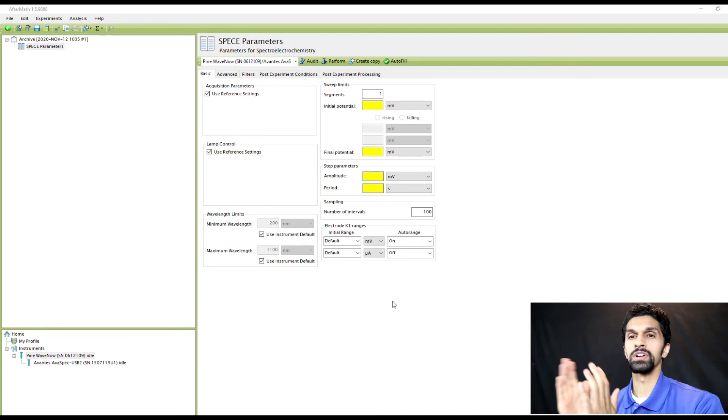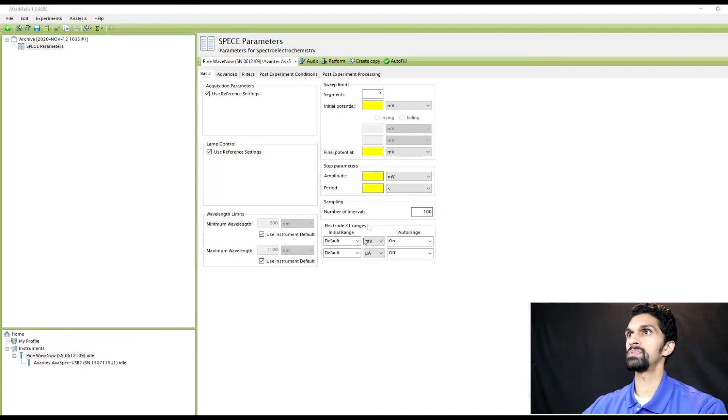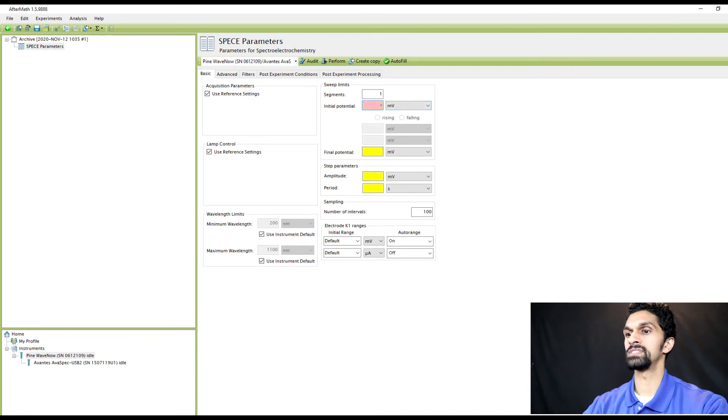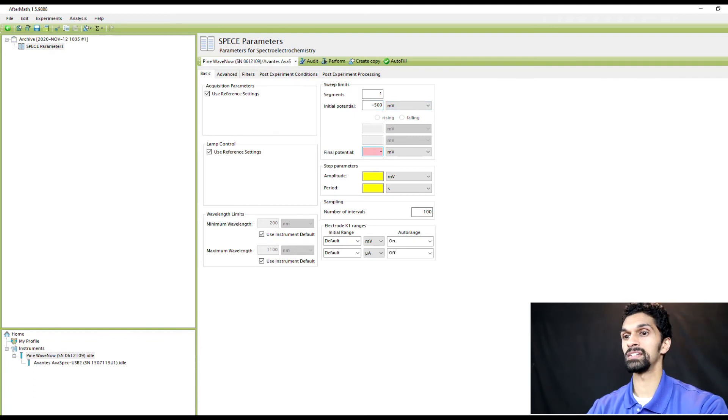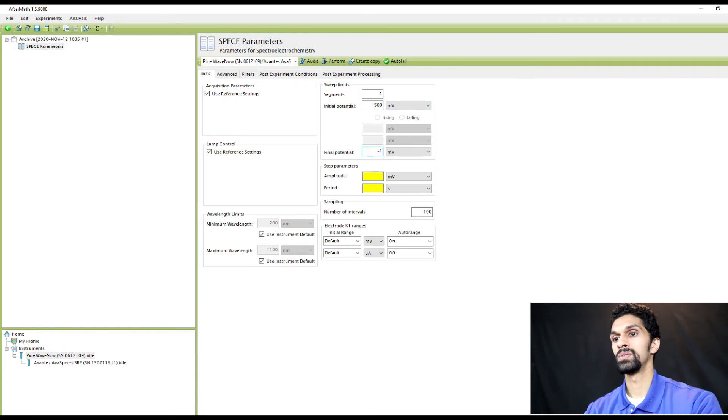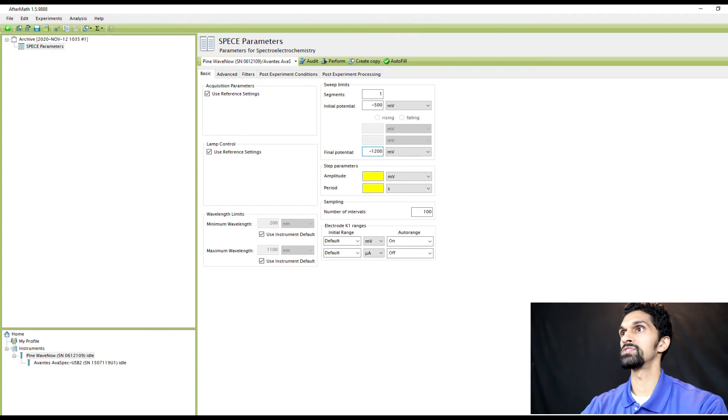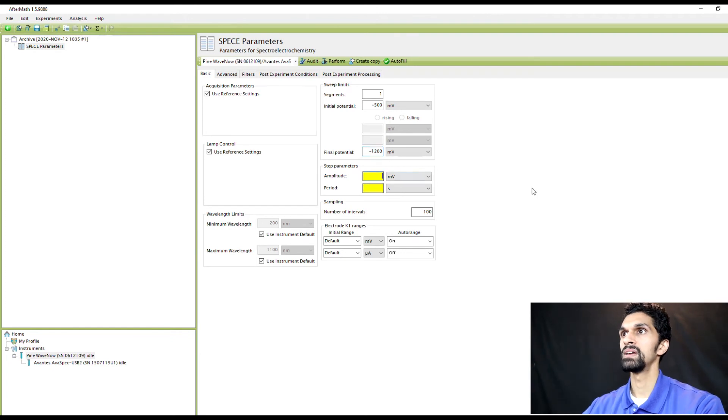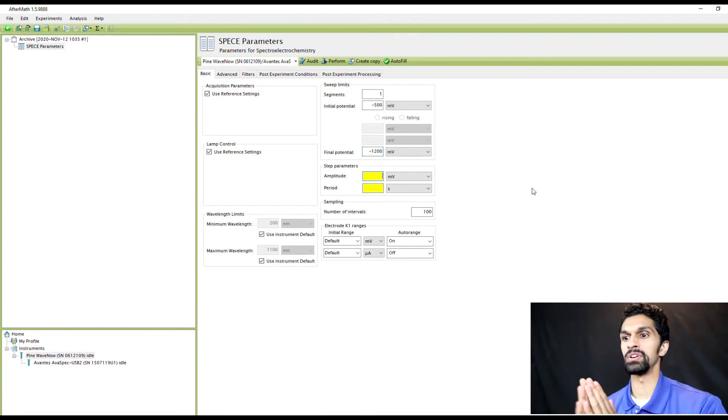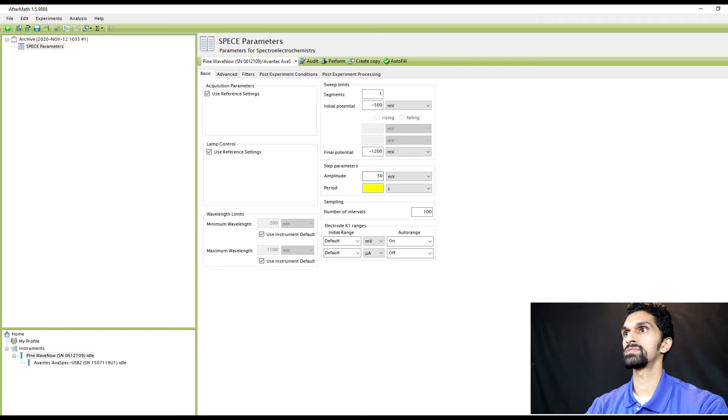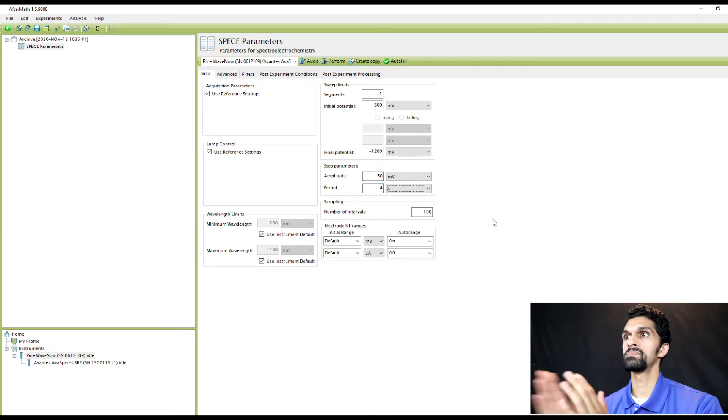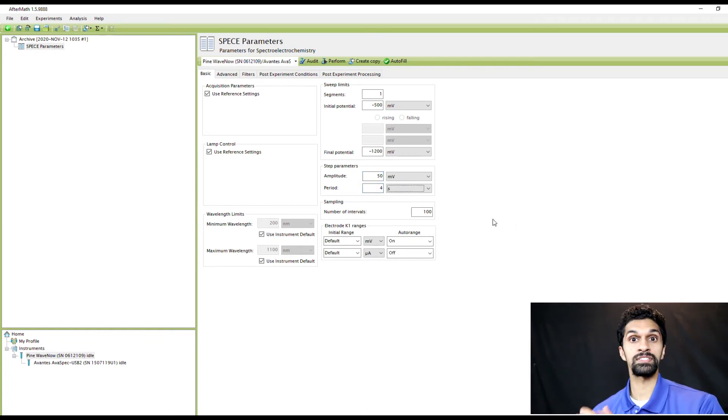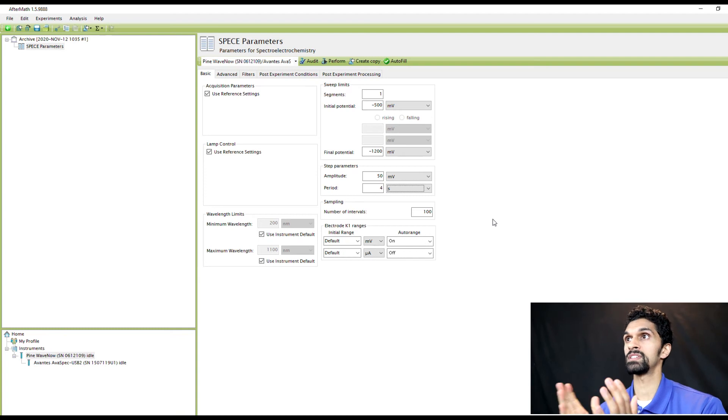Let's take a look at methyl viologen as an example. We're going to do one segment for the sweep. The initial potential is negative 500 millivolts, the final potential is going to be negative 1200 millivolts. I'm going to have an amplitude of 50 millivolts. I'm going to hold it for about four seconds. All I need to do is hit the Perform button and we'll do a spectroelectrochemistry experiment of methyl viologen.